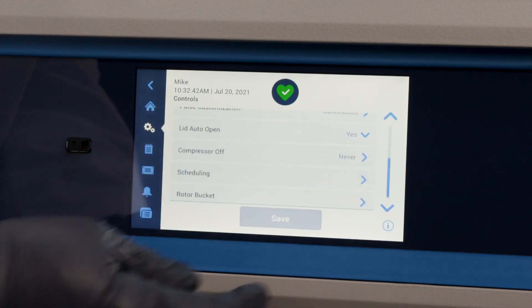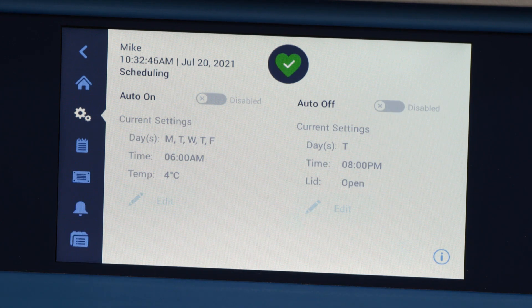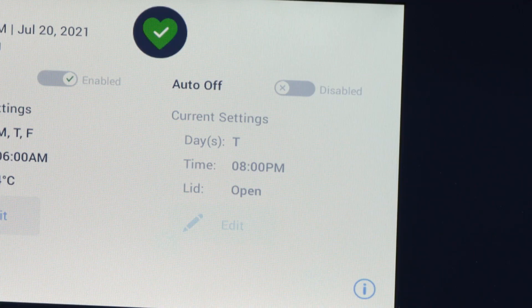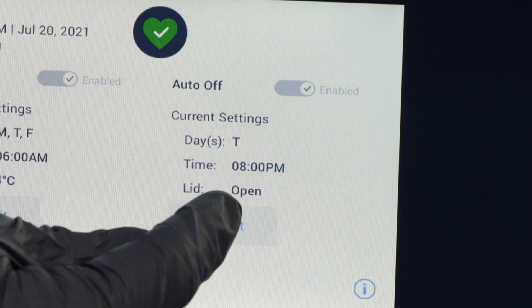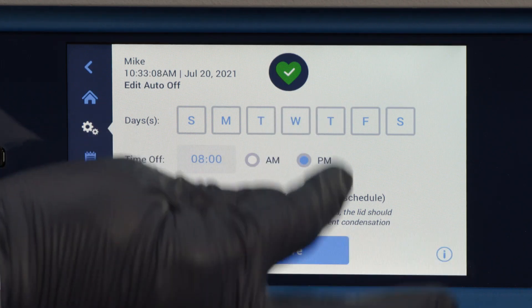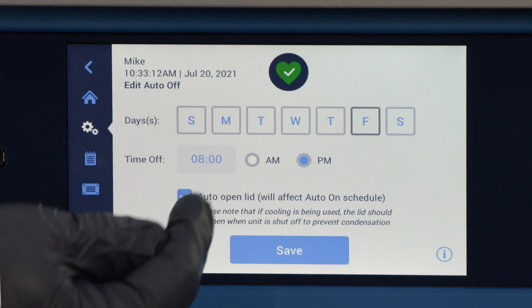There is also a convenient scheduling function that will allow you to pre-program the startup of the unit so your centrifuge will be ready at your desired temperature when you arrive in the lab. The Auto-Off function can shut down programming to extend equipment life and reduce energy usage. This function can be customized for any day of the week and has the option to auto-open the lid to ventilate the centrifuge when not in use.